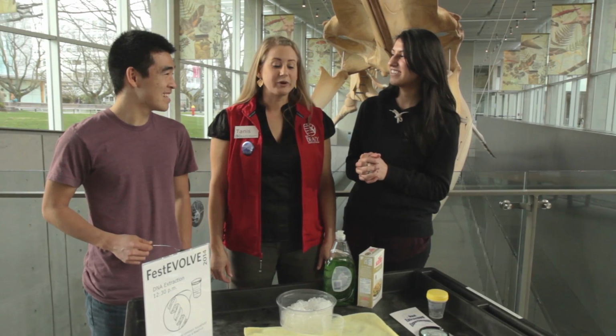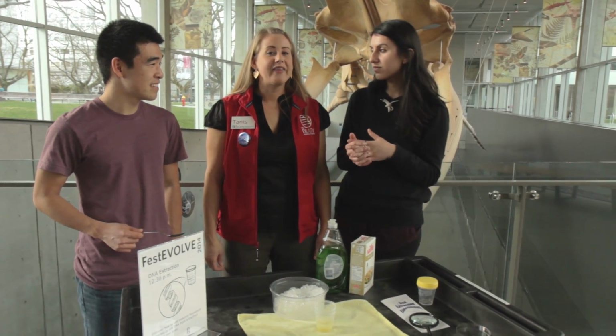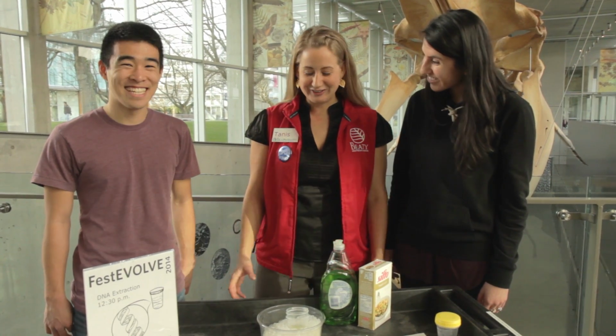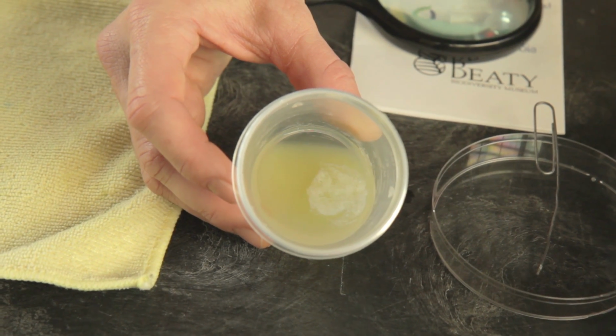So last but not least, we're going to put this on ice so we can get the reaction to go really, really well. And this will take a few minutes, but don't worry, you won't have to wait. So through the magic of technology, we're all ready to go. I'm going to take this off the ice so we can see the long strands of DNA that have formed.